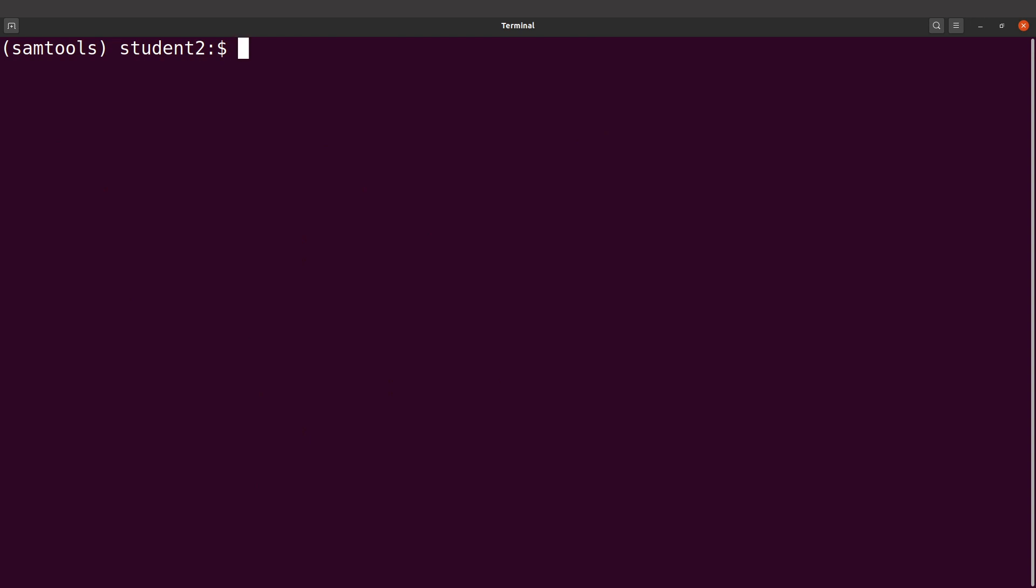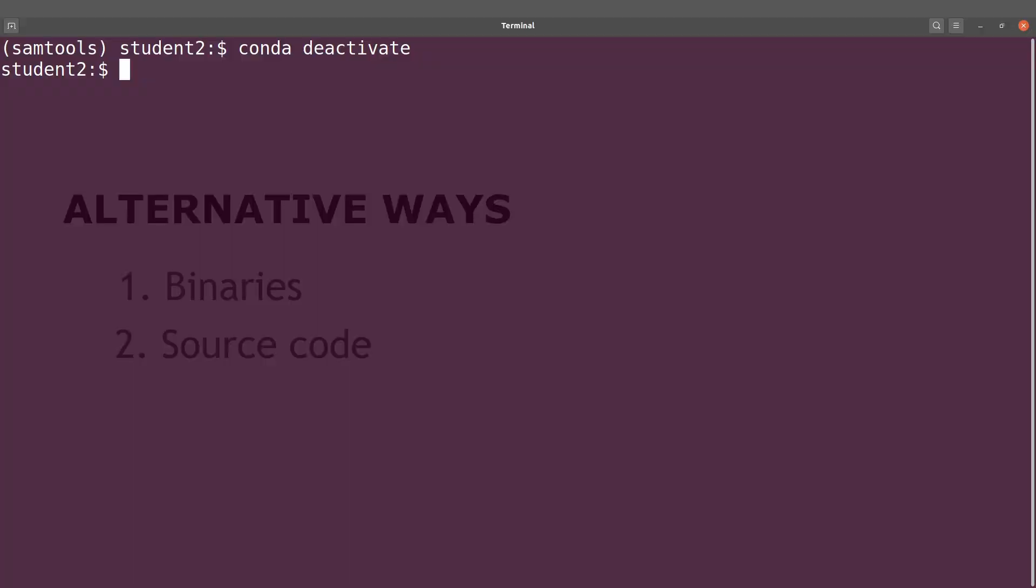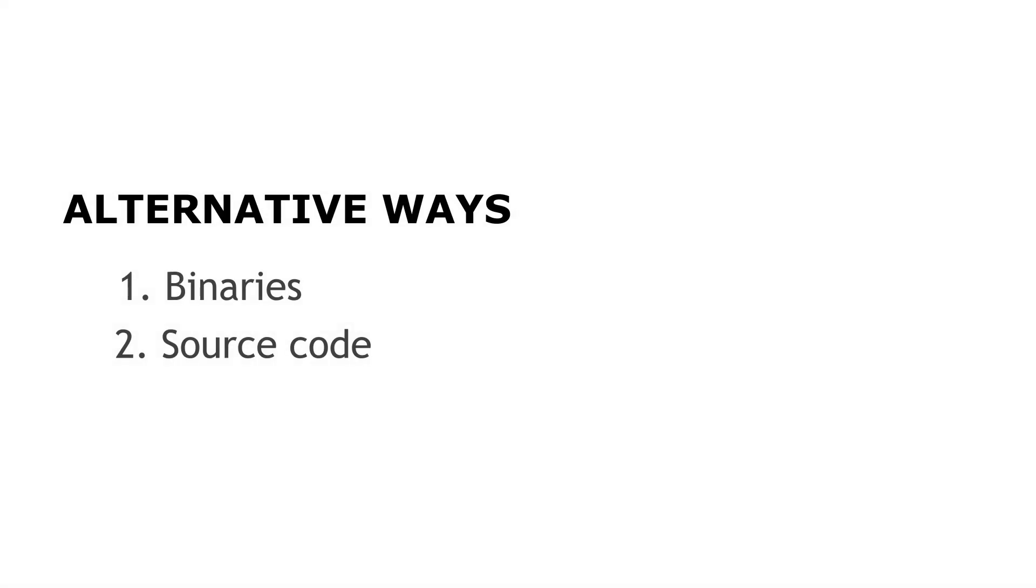Now if you're done, we just have to deactivate the environment. We type conda deactivate, and now we're done. Now you can no longer run samtools - you can only run it when you activate the environment. That is it.